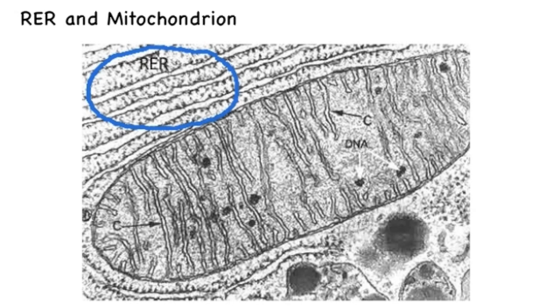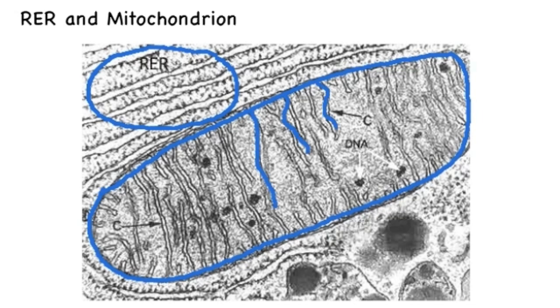In this image we can once again identify the region of the rough endoplasmic reticulum by its association with ribosomes. But the larger organelle present here is the mitochondrion. We can see the lines that we previously represented on our diagram — the internal compartments formed by the inner membrane of the mitochondrion.